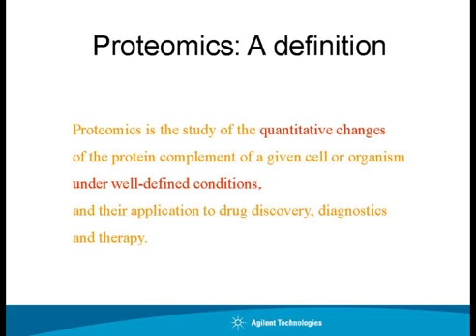Whenever you measure the quantitative changes of a protein complement, it becomes proteomics. Of a metabolite complement, it becomes metabolomics. Of RNA, transcriptomics. Glycans, glycomics. Lipids, lipidomics. Anywhere where you measure the changes and you quantify them, it becomes omics. Okay, so that is how it is.